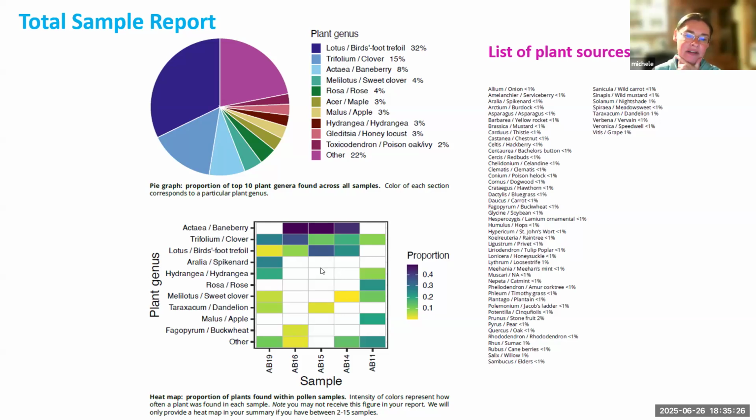We used to have these called heat maps. I did end up taking them out because they seemed to cause more confusion, but I like to show them occasionally when people want to see the data represented in a different way. What this map tells you is, if you're looking at a particular plant across a number of samples, the darker and more intense the color, it's a visual graphic of who was hot and who was not across a group of samples.